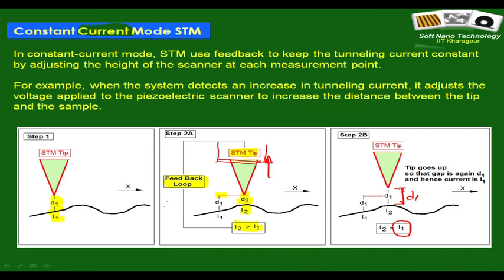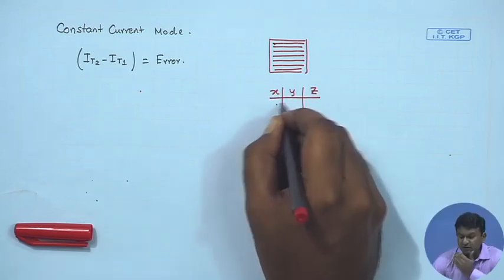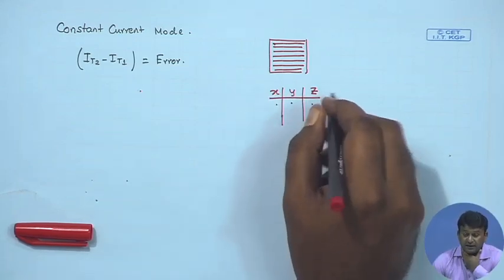If you can track that, let us say with respect to this point, if we term this to be z equal to 0, you can always identify that, well, here z is equal to plus 2.3 nanometer, next point when it goes here it is minus 1.7 nanometer and something like that, and then essentially at the end you get a data set which is simply x, y and z.